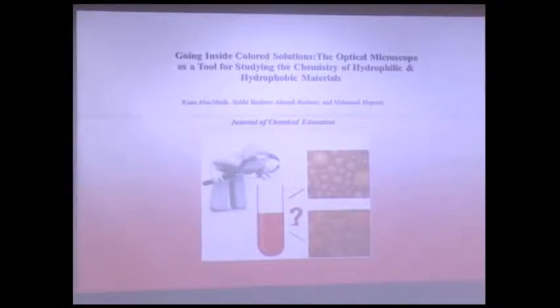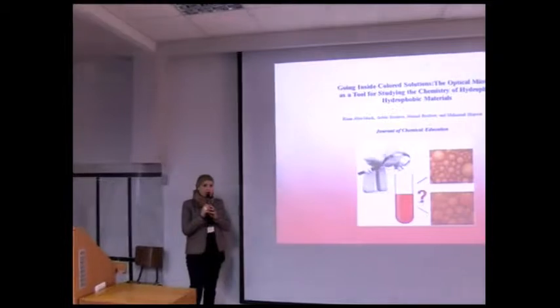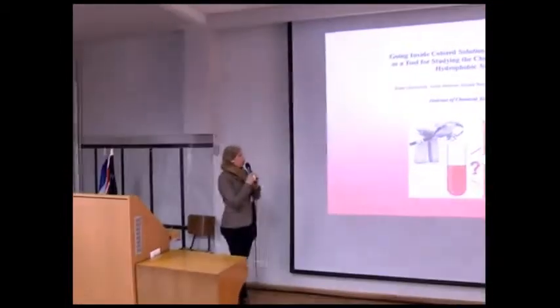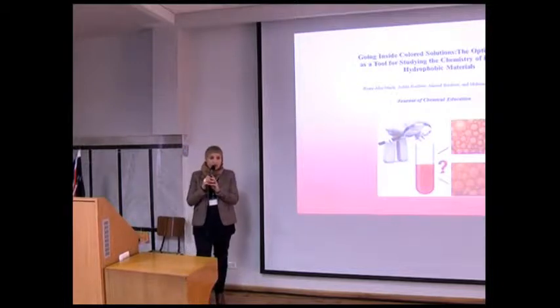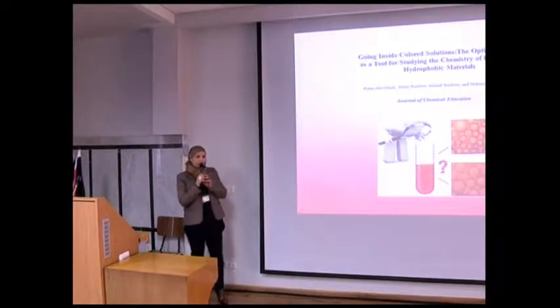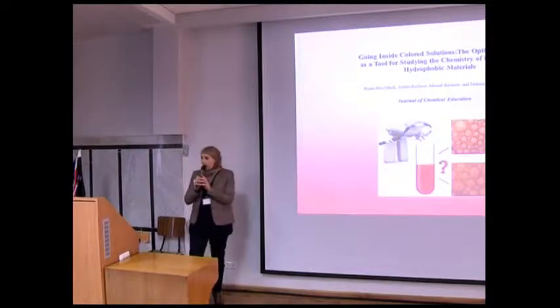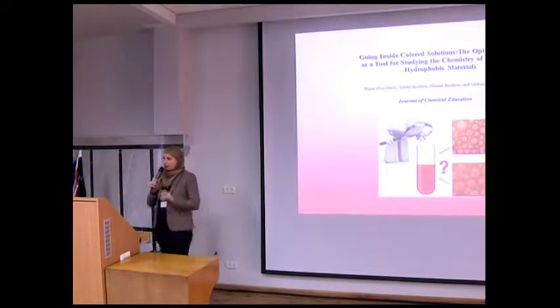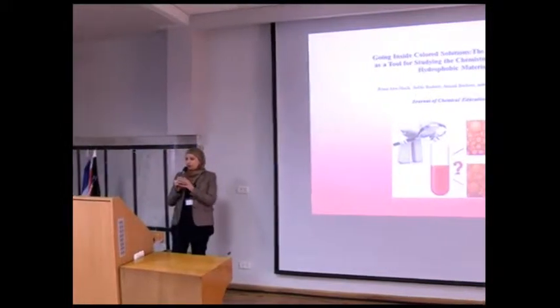Okay, I want to talk today about a lab activity which was held here in the college. It's a collaboration work between me and Dr. Ahmad Bashir, and Dr. Muhammad Hujirat. This lab activity was published recently in the Journal of Chemical Education, and it's called Going Inside Colored Solutions, the Optical Microscope as a tool for studying the chemistry of hydrophilic and hydrophobic materials.